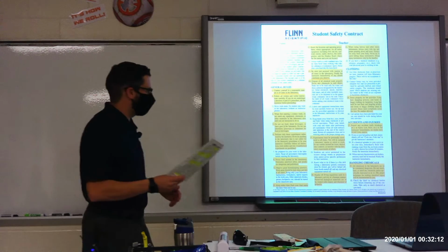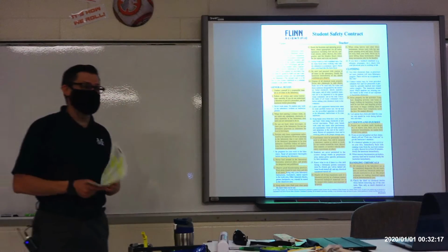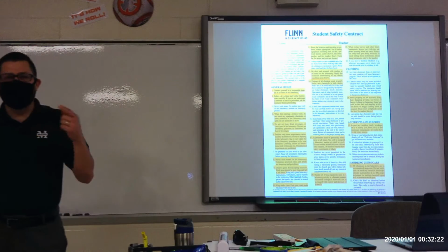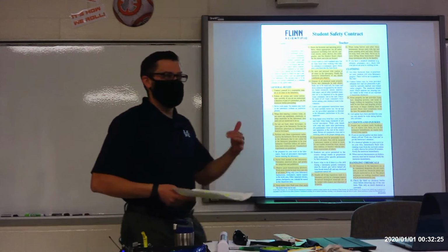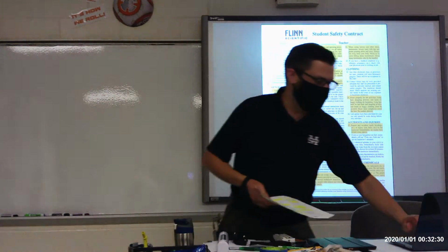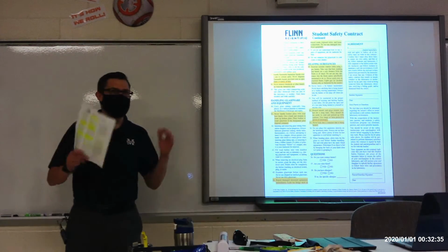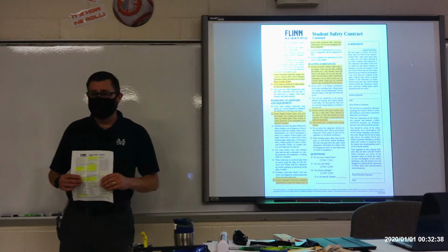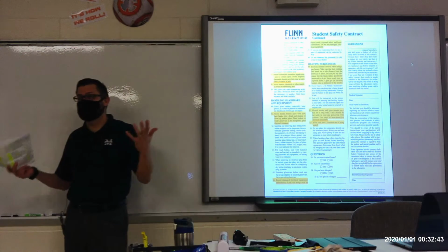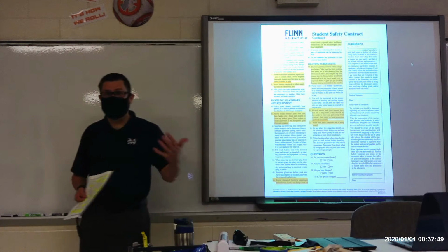Going down to the last section here at the bottom, number 31, handling chemicals. All chemicals in the laboratory are to be considered dangerous. Again, we don't use too many serious chemicals in this class, but if we always consider the chemicals we're using as dangerous, then we are going to treat them with the proper level of respect necessary. And there's only one lab I can think of where there's really only a few chemicals we need to worry about. But even those are just basic household chemicals. But there are some household chemicals that you might have in a cabinet or a cupboard at home that are potentially dangerous if you don't treat them properly.